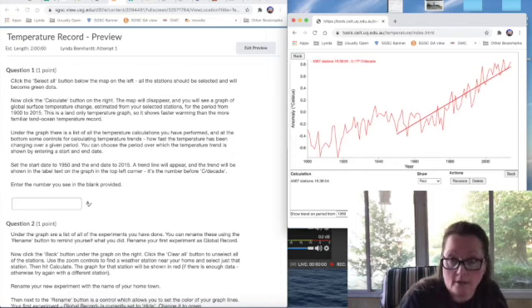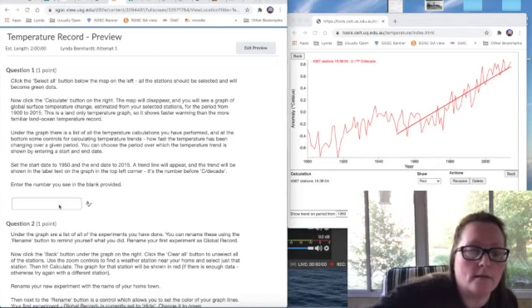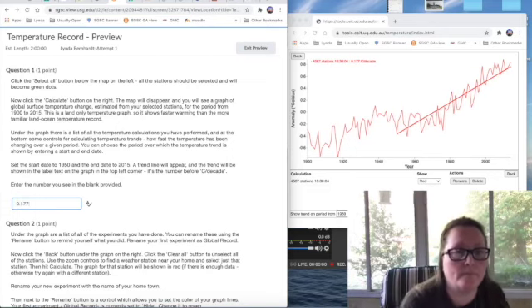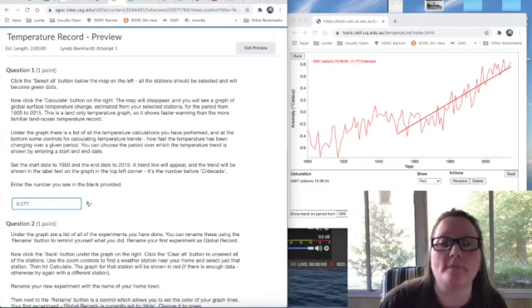Trend line will appear. Trend line is the line you see, and will be shown in the label text on the graph in the top left corner. So that would be right up here. So now you enter this number right there. So we are going to put in 0.177. Enter. That is your answer. I just gave you the first answer.